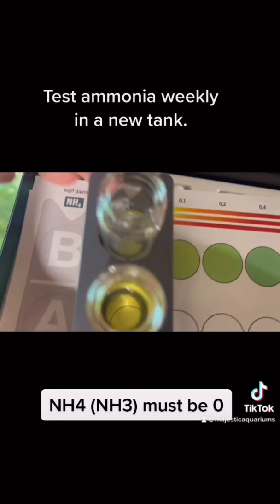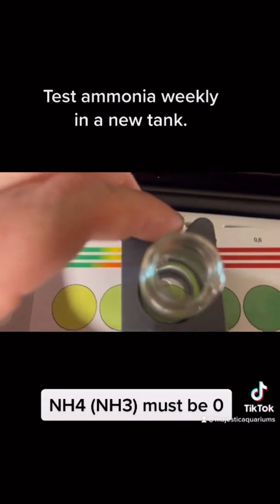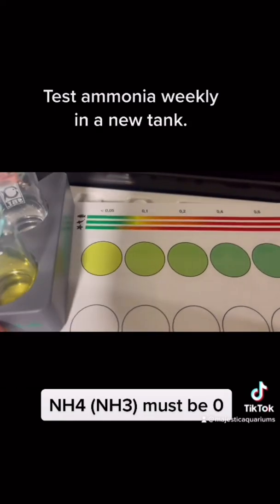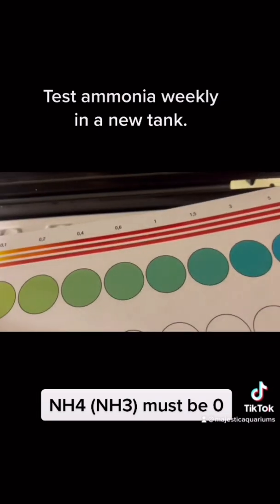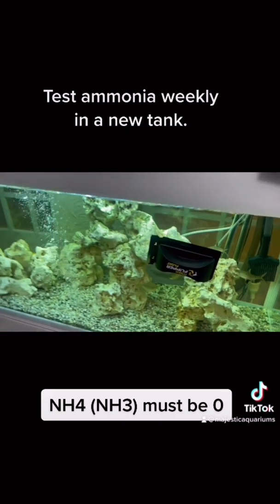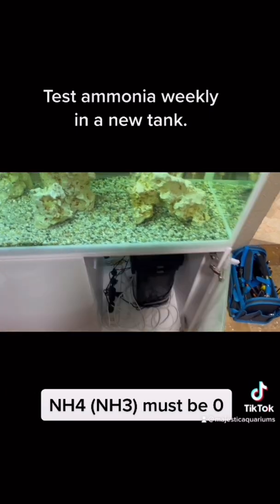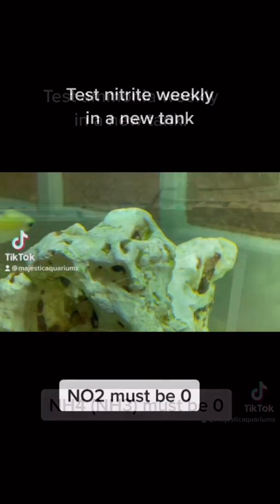So in this case, that's 0, because that's yellow. And the greener it gets, the more ammonia, until eventually it goes blue. Because that's yellow and there's no green in it whatsoever, yellow is 0. 0.05 is that one. It's got a little bit of color in it. So this particular tank has 0 ammonia. And 0 ammonia means that there's been enough good bacteria that's grown in our filter to break the ammonia into nitrite. So next I'll show you how to test nitrite.